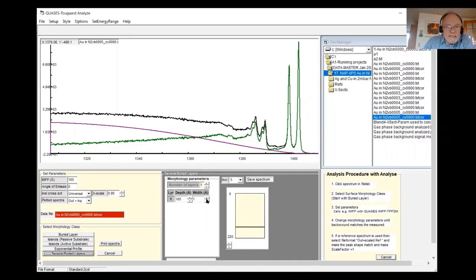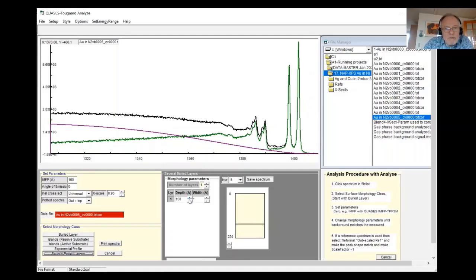By the way, this is done by choosing a thickness of 1 angstrom and then varying the depth. What this will do is take the spectrum from this assumed layer here, which is transported through the gas, remove the effect of the gas, and bring the spectrum measured out here back to the spectrum as it was here at the surface.